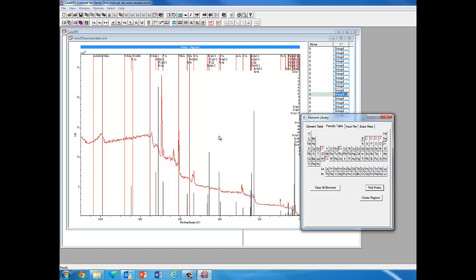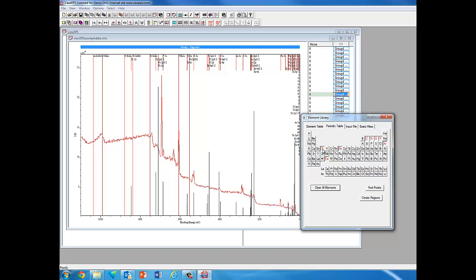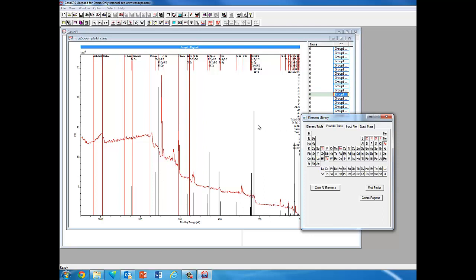These are tantalum, fluorine peak here, oxygen peak, some other tantalum peaks. It gives you an idea of what it thinks is there, but it may also give you some things that may or may not be peaks depending on your data. You can select various elements. The ones it finds are already selected in the periodic table. If you thought there should have been some nickel, you can select that and it'll show where nickel should be. You can verify whether you actually have the nickel peaks or not. If you have something you don't think is there, you can deselect that. This is a very easy way to identify the peaks, though there is a little more work to verify they really are peaks and that everything is labeled correctly.